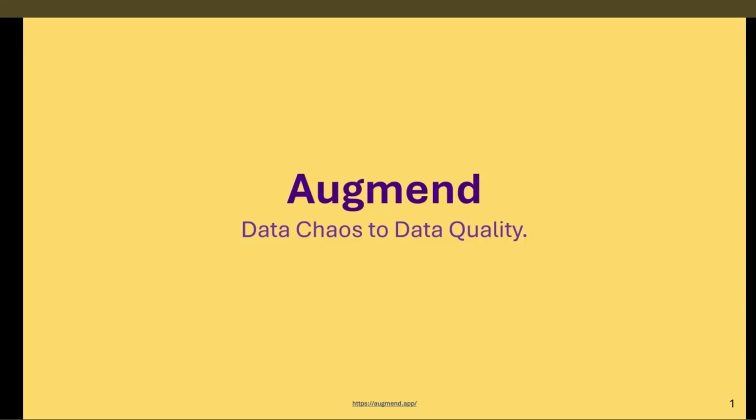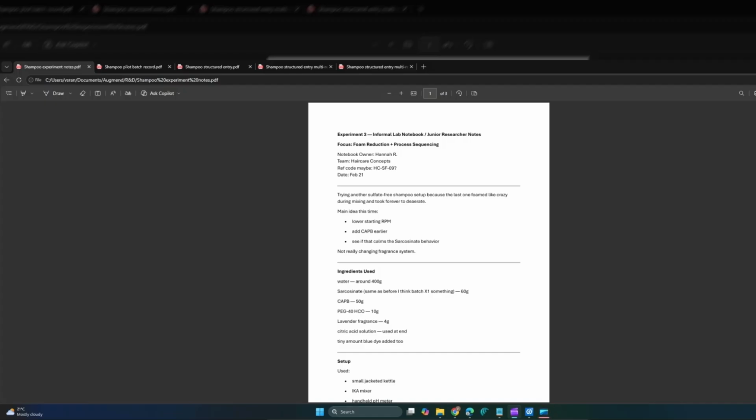In this video, we will take a deeper look at structuring data from realistic and sometimes complex experimental records using Augmend. To demonstrate the use of Augmend, we will be using 5 experimental write-ups from a shampoo formulation lab. So here on my screen, I have the 5 write-ups.